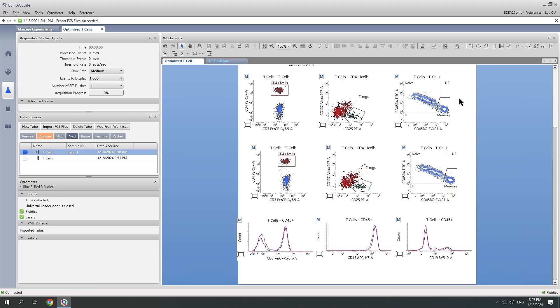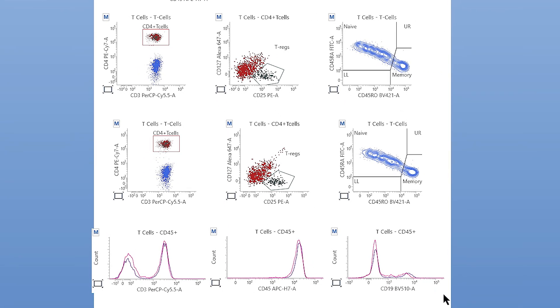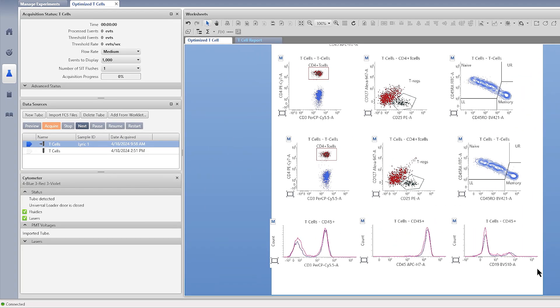Now we have successfully completed the assay transfer to the Lyric in San Diego. Let's see how the data looks. The first row is the data collected on the instrument in San Jose, and the second row is the data we just collected in San Diego. The last row shows the comparison and overlay between the two data. We have successfully standardized the assay between the two instruments.